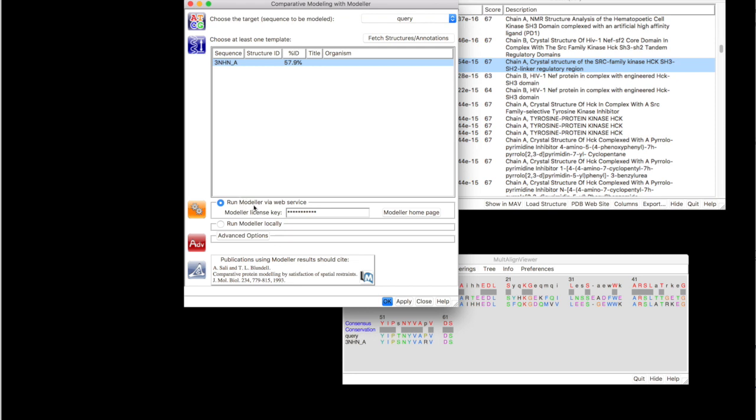Modeler can be run either via web service or can be run locally. Regardless of the method used, you have to apply for a modeler license key. Once you have a license key, you are going to insert that in this window.